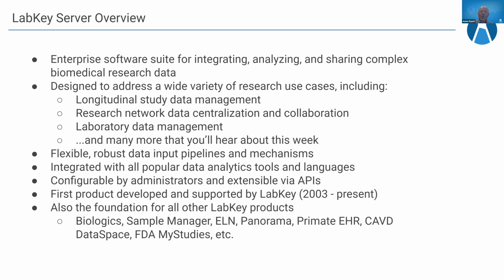And then likewise, on the other end, once that data is integrated and secured and transformed and QC'd and manipulated in various ways, you need to get data out again to a variety of constituents in the form that they want to see that data. So whether you're using a high-level tool like Tableau or Excel or Access or Spotfire, or perhaps a statistical tool like SAS or R or Stata or MATLAB, or maybe you're more of a programmer using Python or Java, JavaScript, Perl, something of that nature, LabKey has an integration that will work for you. I think it's fair to say that we integrate with every single popular data analytics tool out there. Because again, we partner with our clients and they tell us what tools they're using and what integrations they need, and we develop those.